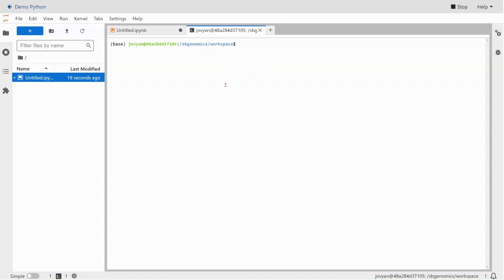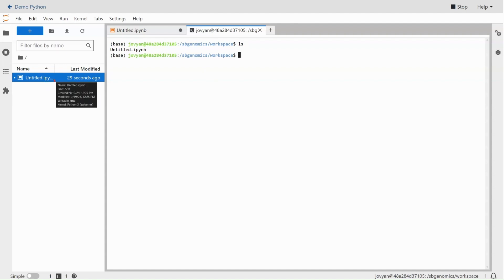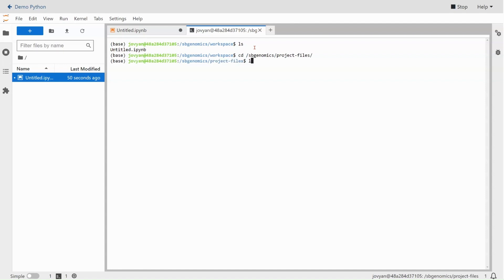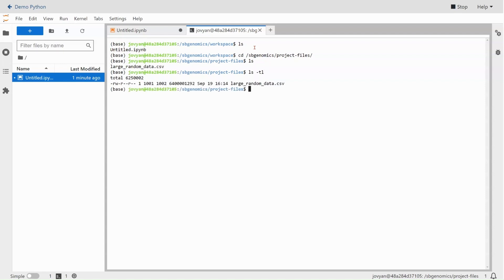The file that I want to work with is actually located in my project files directory. If we type ls here, we see only this file, untitled.ipynb. But if we change directories to /sbgenomics/project-files, you'll actually see the large random data that I want. We can get the file size here. It is six gigabytes.